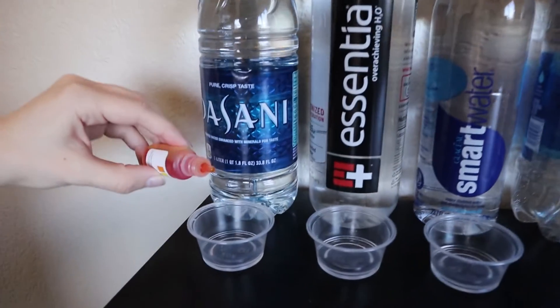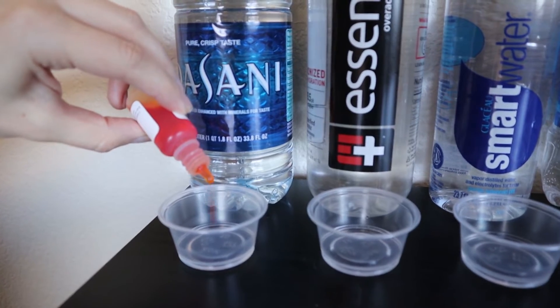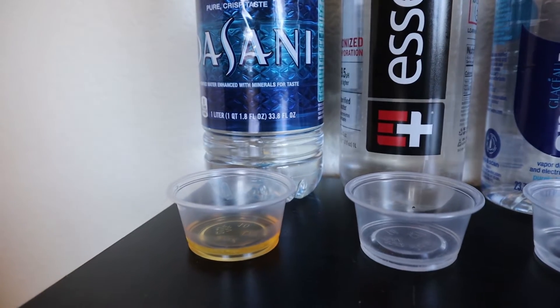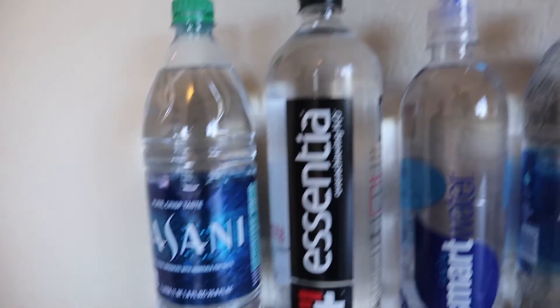First off, starting with Coca-Cola's brand of water, Dasani, we're noticing some acidic color going on. I'll give that a 4.0 — so very acidic. Depending on your health needs, stay away from Dasani if you are avoiding acidic waters.